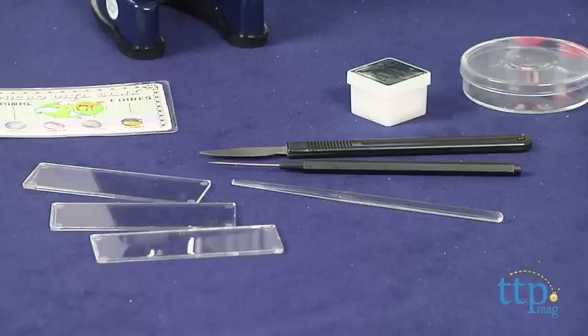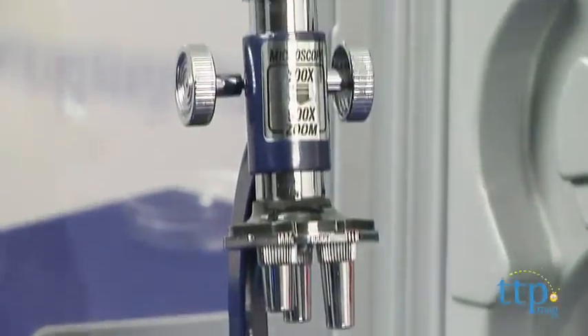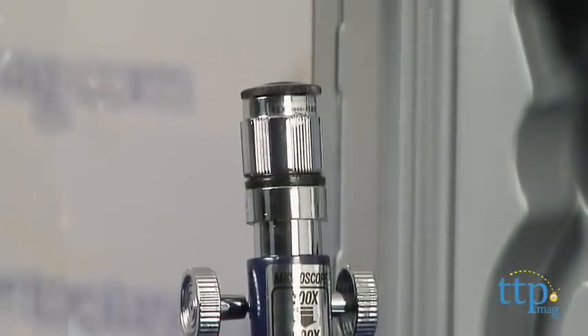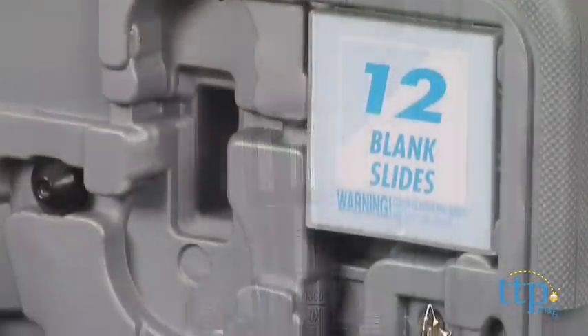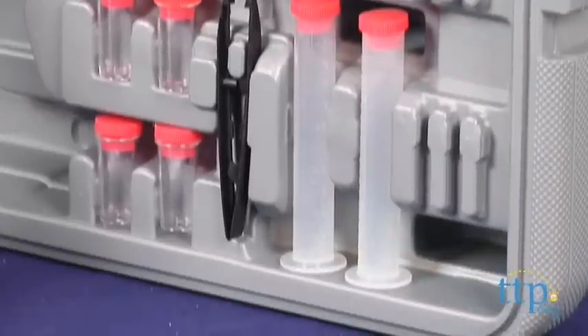It includes an 8-inch microscope with 100-900 power magnification on a zoom lens, and a mirror and a light, and all the accessories kids need — slides, slide covers, tweezers, collecting vials, and more.